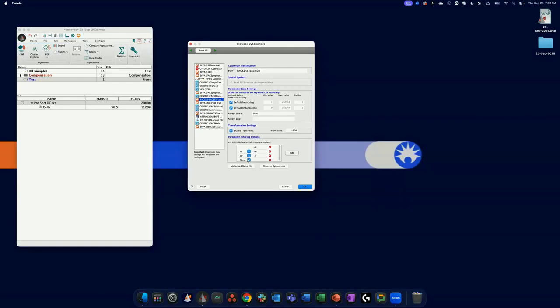You could create a rule that says, well, if it has these, but not something like SCH, right? So I still want to keep the height parameter for my scatter or something like that. So you can create these rules and that'll help filter that list by like 70%. And you only have to do it once.